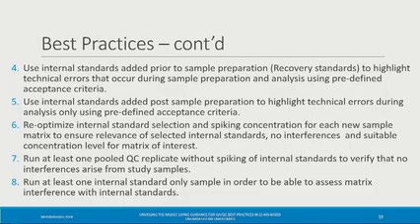In general, I think most people would be pooling before internal standard, so you are treating your aliquots of the pooled sample as if they were study samples, right? So you pool them, then you aliquot them, then they become kind of the same as your study samples, and then you add your internal standard and so forth. So I think for that workflow, it would work well, but you are completely right.